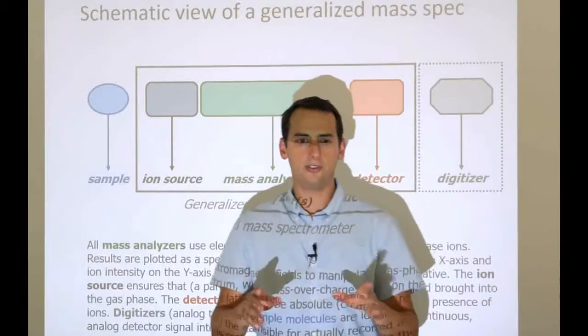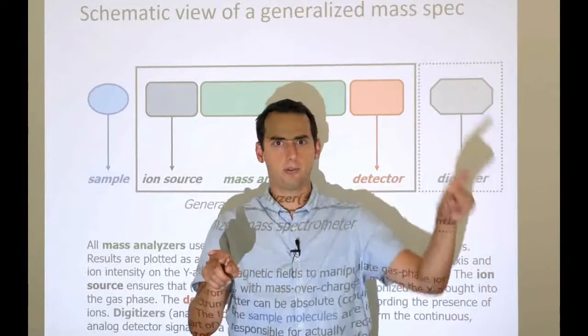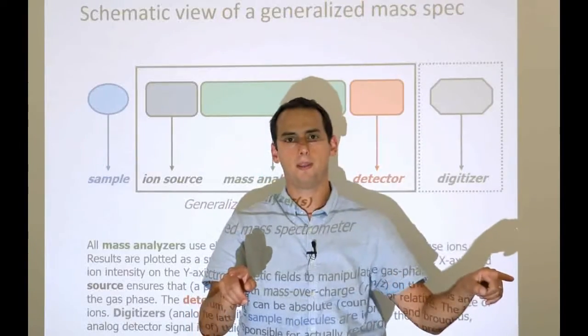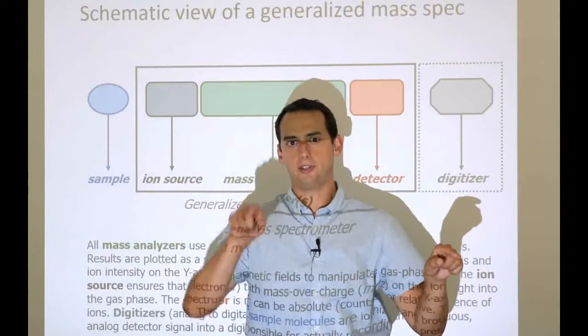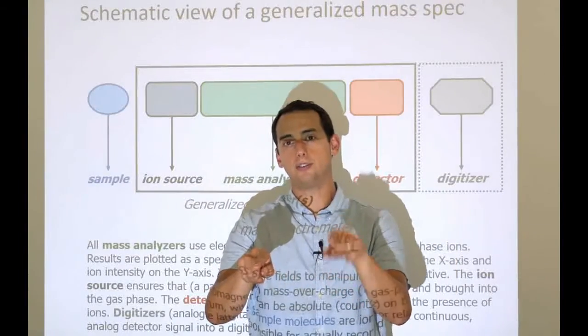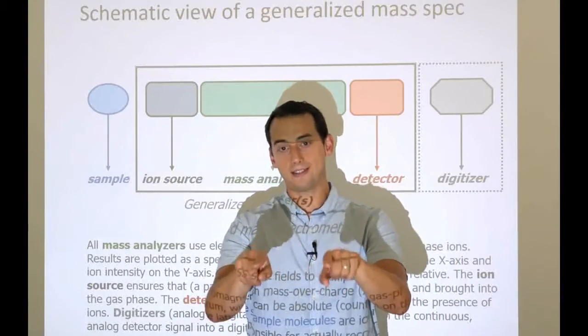Suppose you have a slow digitizer, and we have a curve that spans roughly this. So there's a signal coming in and then going down again. If we have a digitizer that measures at this point and then is going to be silent for a while, and then it's going to measure again, because that's as fast as it can go.